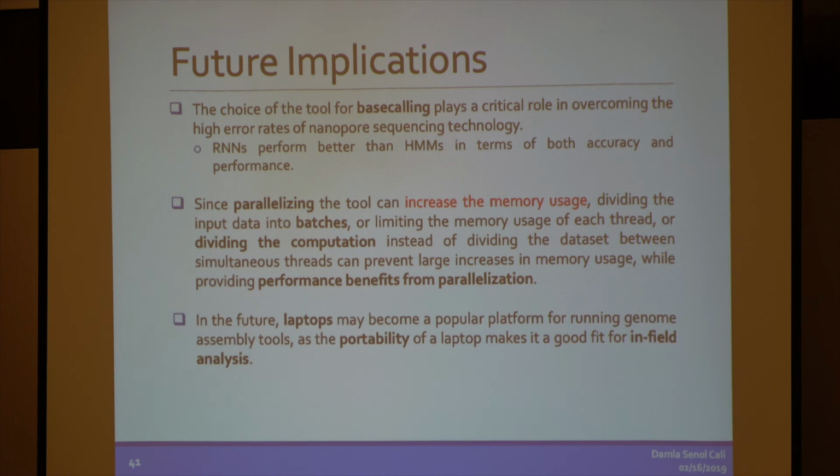And the last thing is, since Nanopore sequencing provides real-time analysis and it's portable, we can use it for in-field analysis, like outbreaks, Ebola, Zika outbreaks, where resources are limited. Because of that reason, laptops may become a popular platform for running the assembly pipeline. And we should keep in mind that laptops have greater memory constraints, lower computational power, and limited battery life. So it's important to take these into consideration while designing algorithms or accelerators.